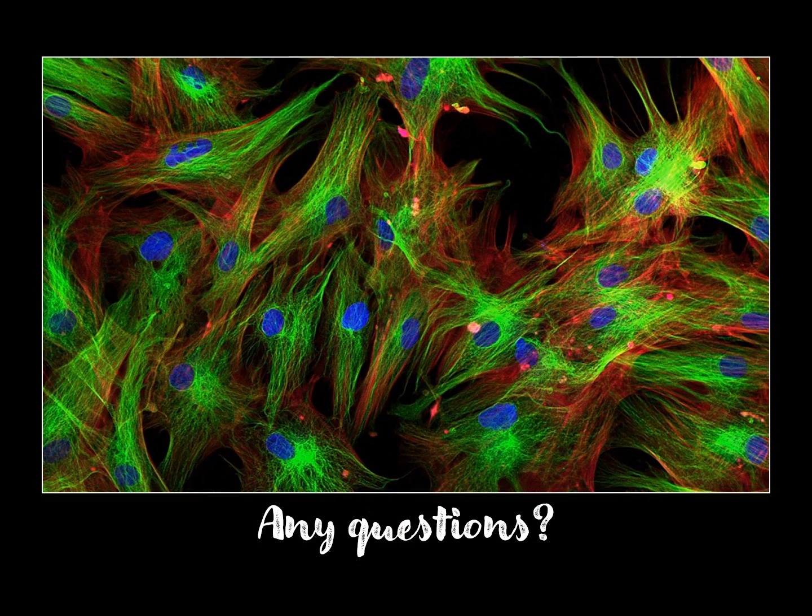So here we have a very beautiful immunofluorescence image where you can see that three different stains have been used. The blue stain used over here is called DAPI, which is used to stain the nuclei of the cells. And as you can see, we have one green fluorophore, that emits light in the green range, and another fluorophore which emits light in the red range. So this is a classical example of visualizing two different molecules or proteins which have been stained using two different fluorophores.